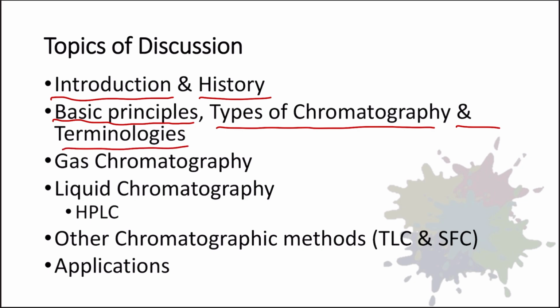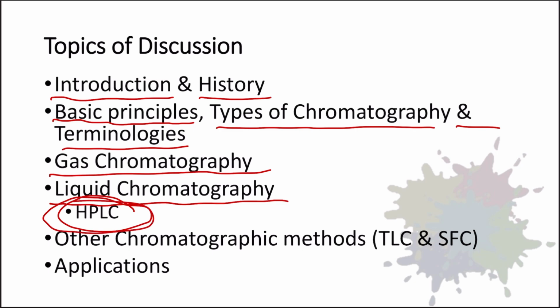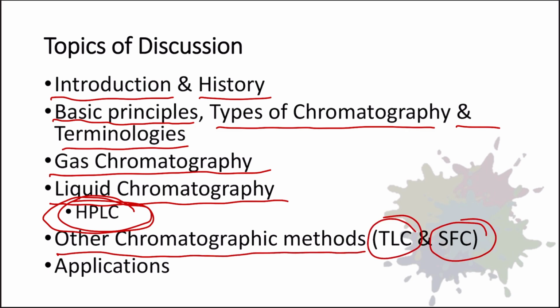Following that, we will be discussing gas chromatography in detail, and then we have liquid chromatography, under which we are going to give a special emphasis on HPLC, that is high performance liquid chromatography. Apart from that, we are going to discuss other chromatographic methods, that is TLC, thin layer chromatography, and SFC, supercritical fluid chromatography. Following that, we will be discussing the applications and finally the summary slide.